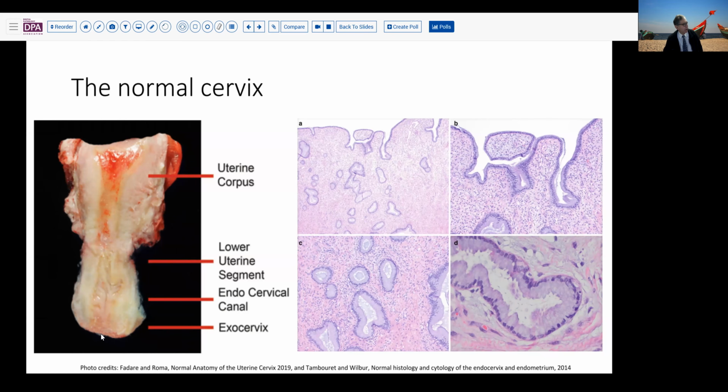The endocervix extends from the squamo-columnar junction up to the isthmus, and usually has a slightly rugated or herringbone type of surface. The stroma of the cervix is usually whitish tan and mostly fibrous tissue with a little bit of muscle towards the periphery that connects very loosely with the myometrium.